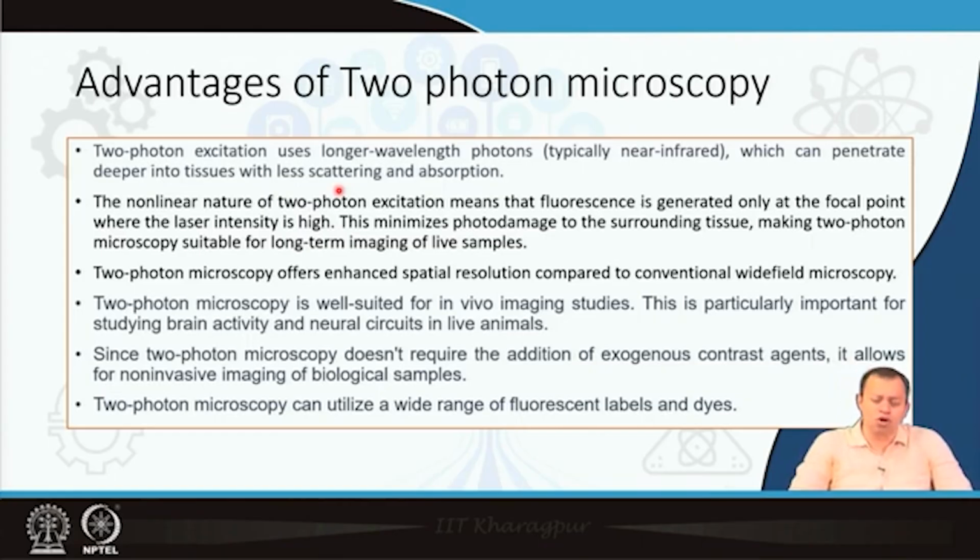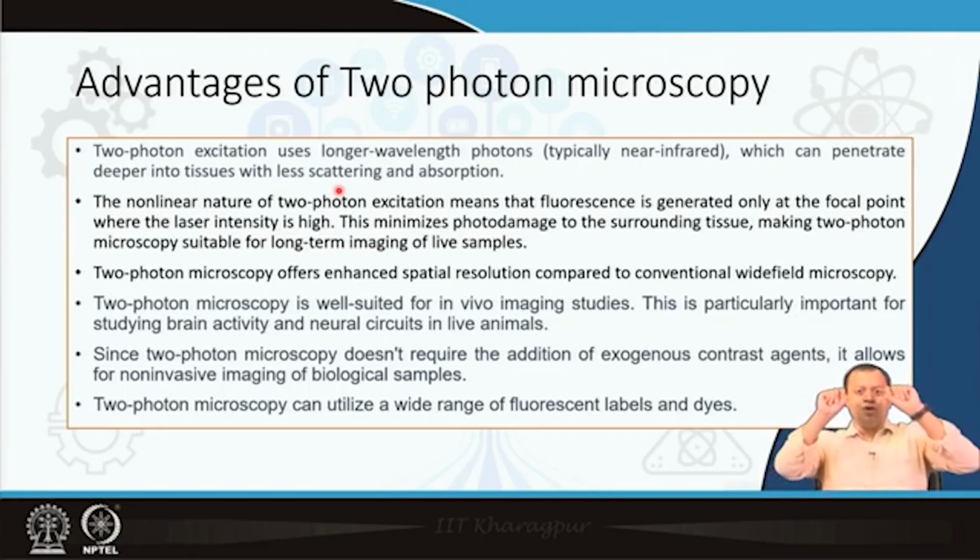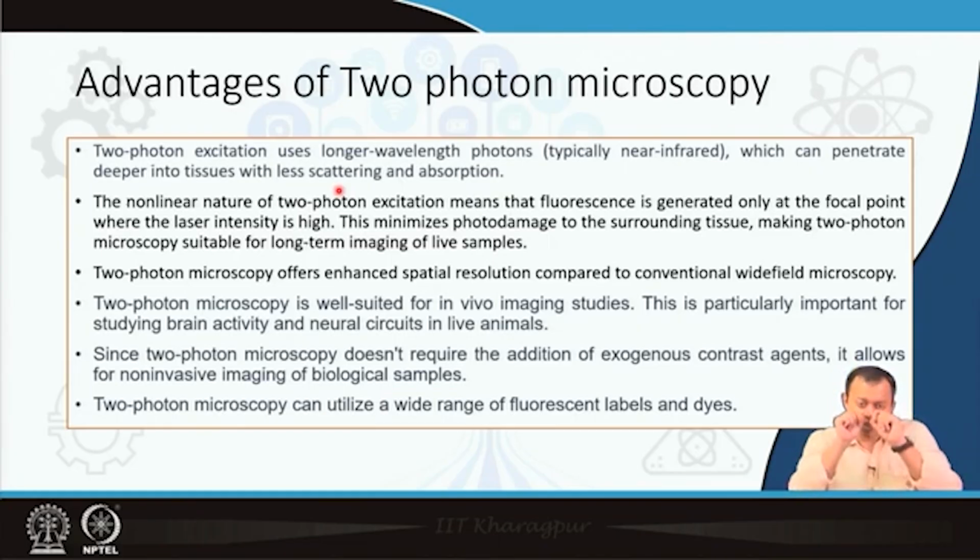They will absorb 2 photons and will emit 1 photon out. Now, if you have made your fluorophore in such a way that this falls within that optical window which brain tissue does not absorb, 600 nanometer to 950 nanometer, 650 nanometer to 900 nanometer, and you are sending these 2 photons one after another or simultaneously, whatever, they can penetrate deeply through the brain.